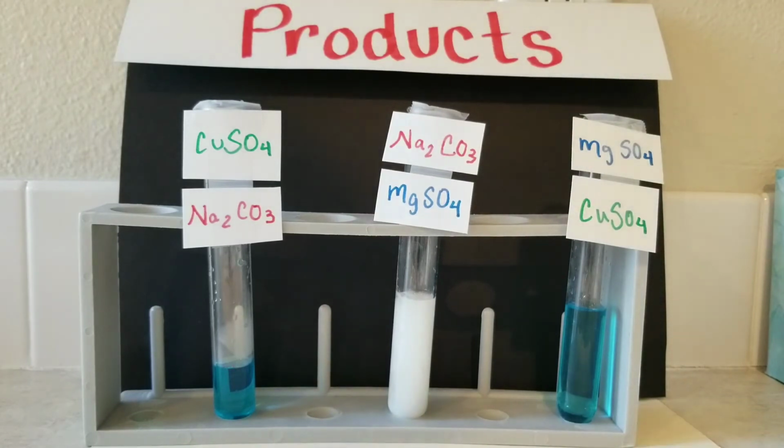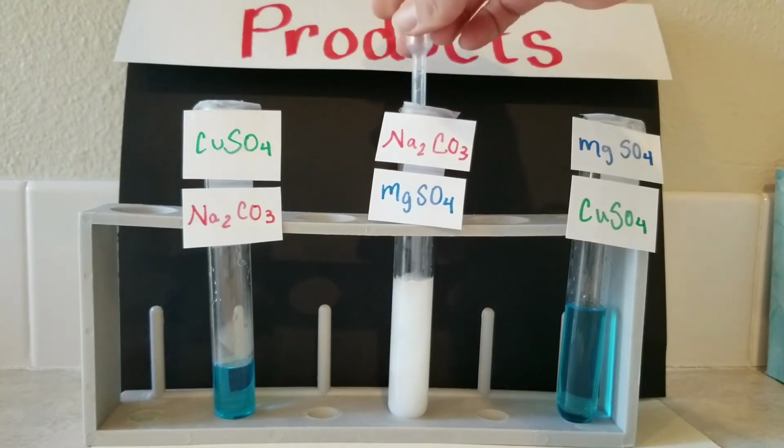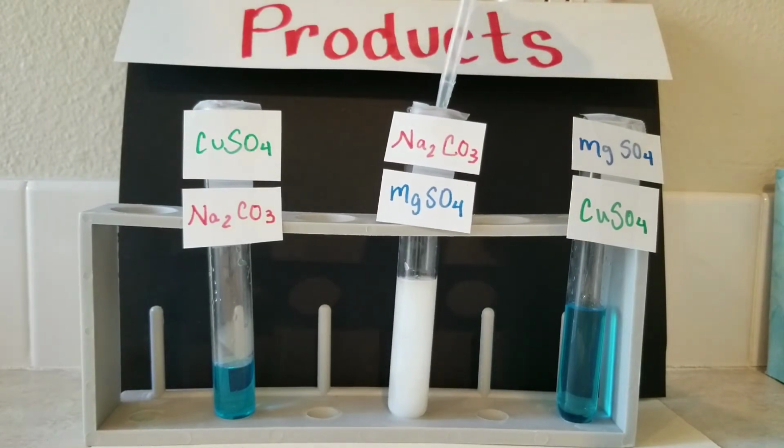So you can see we've got a white milky substance. When we combine these together, it's a little harder to see that it's thicker. The substance is a little bit thicker than what it was as well, like there are chunks floating around in it. There's our second combination.